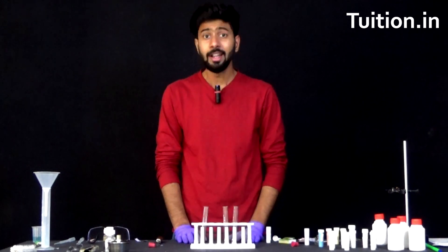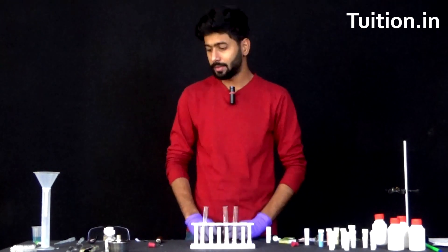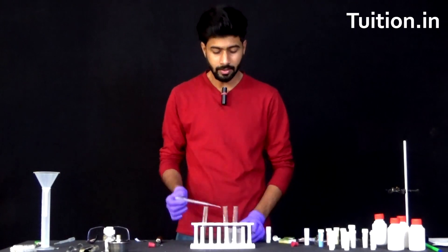Since both the salts are now added, let us add some water to each of the test tubes. Let's add about 5 ml of water in each of the test tubes.